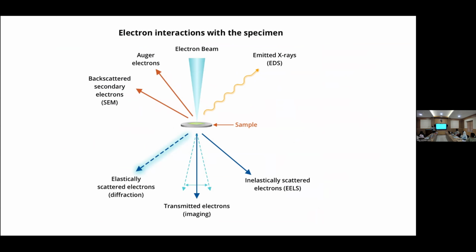So all these are our area of interest, because in the transmission electron microscope we normally use the transmitted beam. All this other part we can consider for SEM, because in the scanning electron microscope we are using scanning coils, scanning the surface, and plotting a 3D surface image. So that is not an actual imaging technique. SEM is a mapping technique. But TEM is a direct imaging technique.